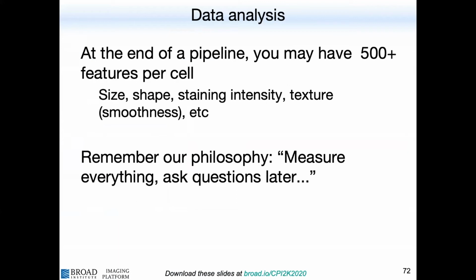Okay, so far, we did detect the objects and we figured out how to find them in the image and how to turn them into measurements. What we are interested in is not just to generate a spreadsheet, but to answer the question we wanted to answer. So the question these biologists who ran this experiment wanted to answer was, what dose of the drug actually caused this GFP transcription factor to translocate from cytoplasm to nucleus? Again, remember our lab motto, to measure everything and ask questions later, and this is the later part. We get to answer the question, and it's the most fun part.